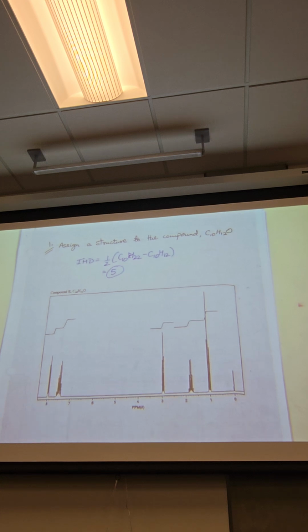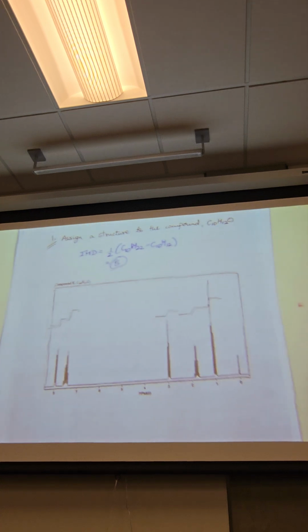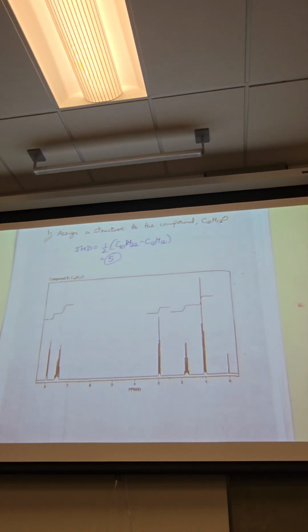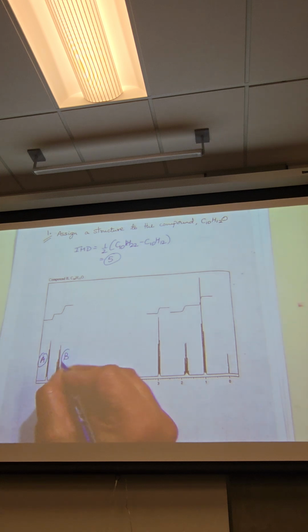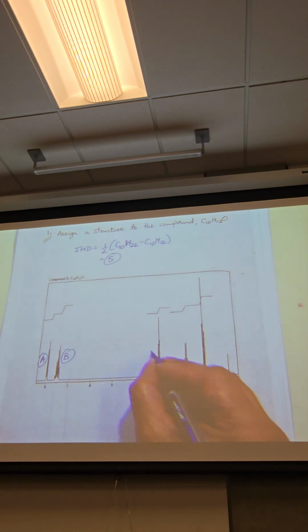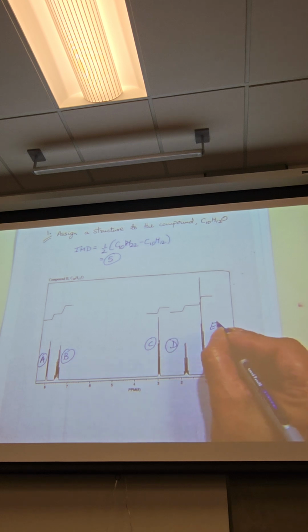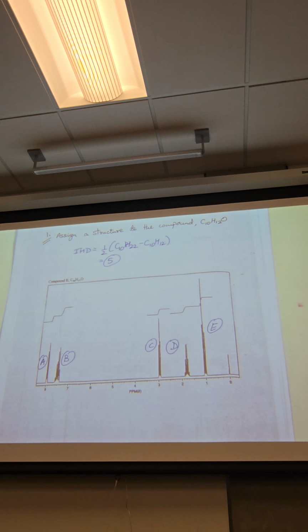How many signals? I heard eight. Eight? Five? Oh, wait, I'm counting each line. No, each line. One, two. Everybody okay? Integration. Okay, this one I have an answer.